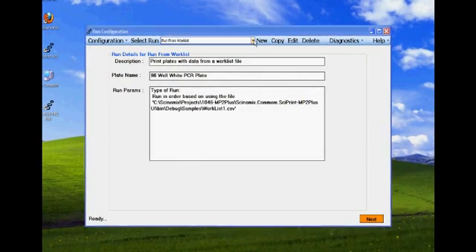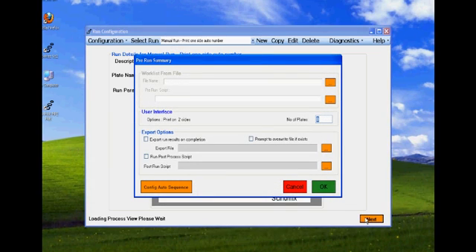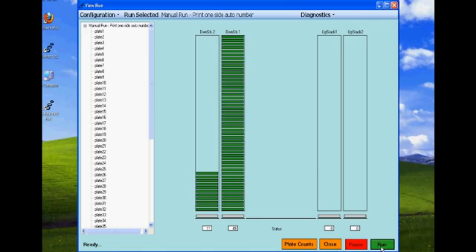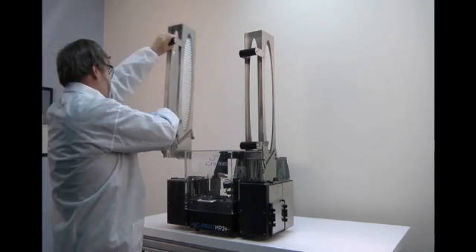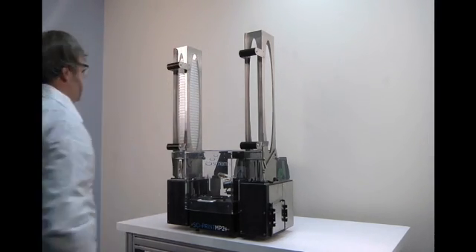Setup of the system is quick and easy. The run type is selected from the drop-down menu on the screen. The number of plates to be run is entered and the plates to be labeled are loaded into the input stack as shown on the screen. The stackers are ergonomically designed for easy installation, each having a maximum capacity of 50 plates.